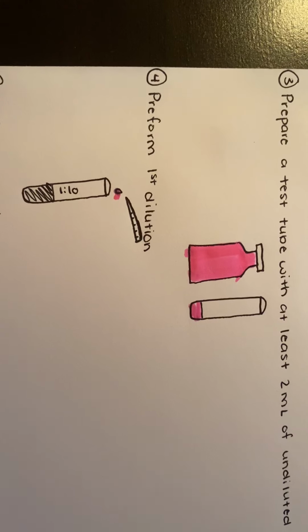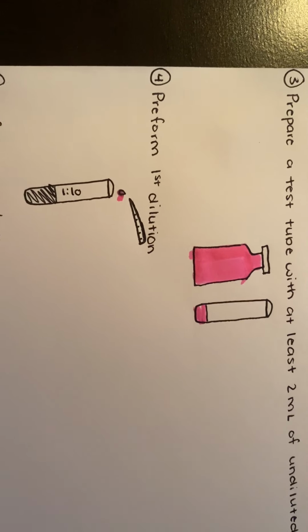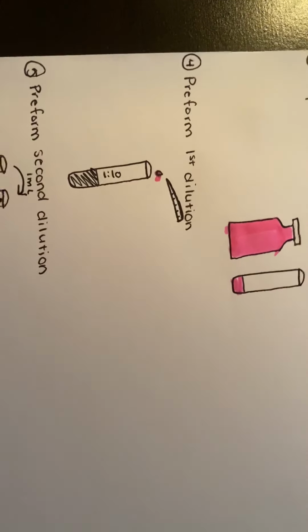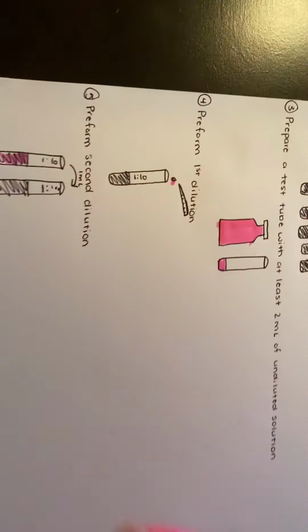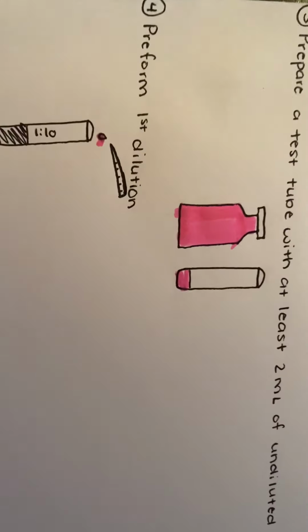And then we're gonna mix that thoroughly. So usually we would take both ends like this, sort of, and do like that. Mix it up. Okay.